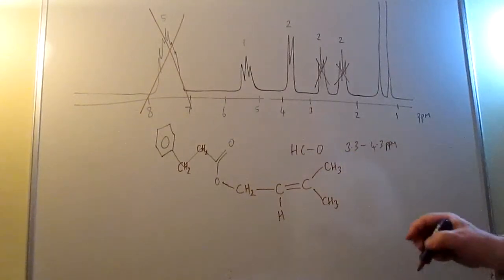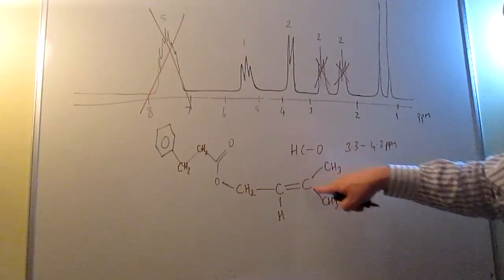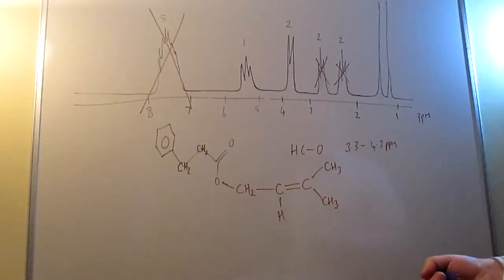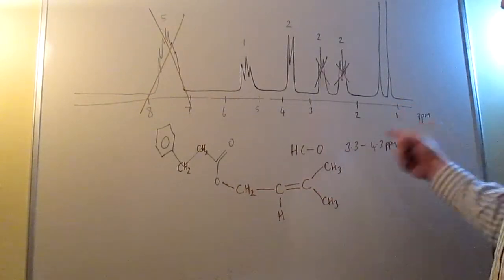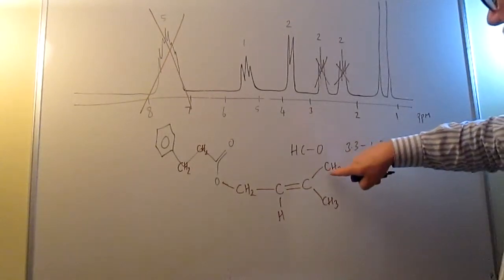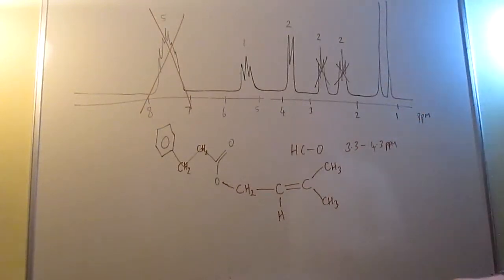In terms of the shifts, well, yes it does, because those are just attached to a hydrocarbon carbon, as it were, there. So the chemical shifts are right, the areas are right, as we said, but the splittings are also right, because the next door carbon is this one, it has no hydrogens on board, so you would expect those to be singlets. So that appears to fit.